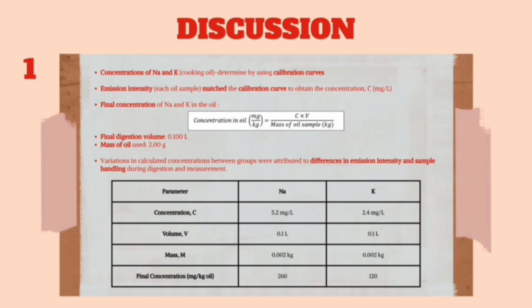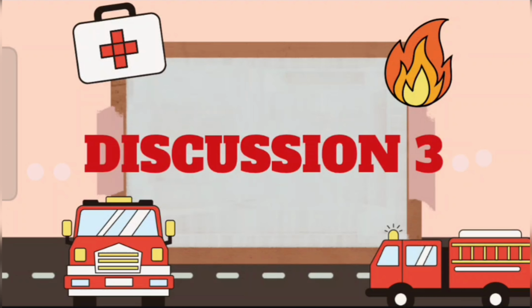Then we inserted the concentration value into the formula of C times V over mass of oil sample. We obtained a final concentration of sodium of 260 milligrams per kilogram, and potassium of 120 milligrams per kilogram.